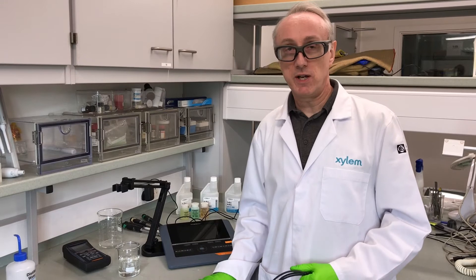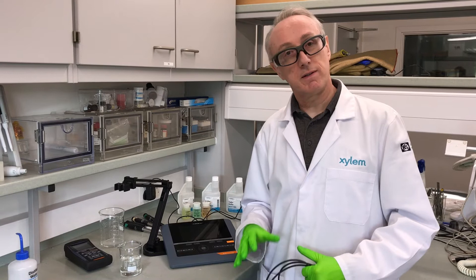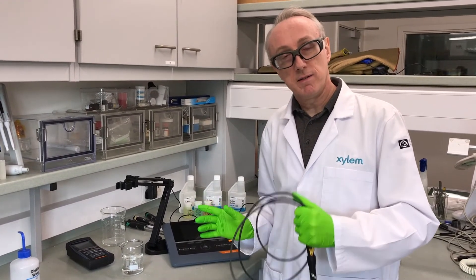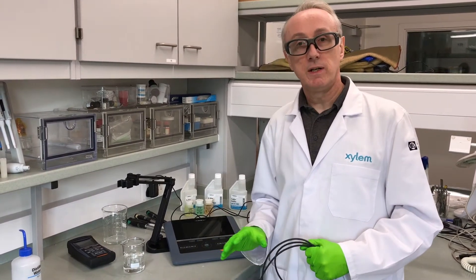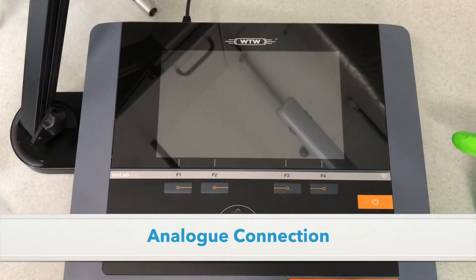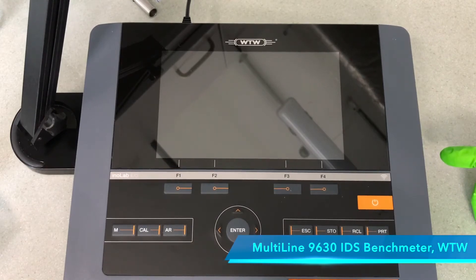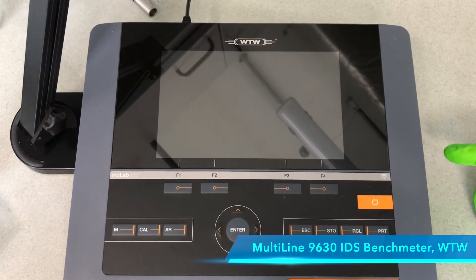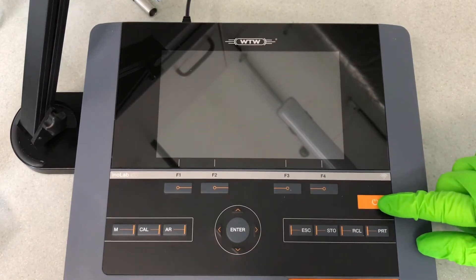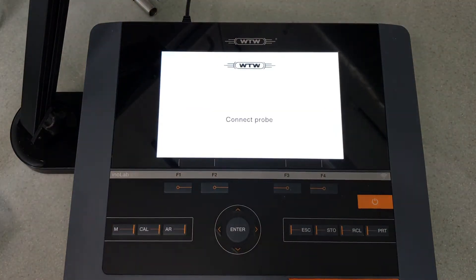In addition to digital technology, we now have wireless digital technology and that adds more benefits. So what we're going to do here is set the meter up from scratch, as you would do if you received it brand new. Here we have the bench meter — this is a Multi 9630 IDS meter. It has three connections at the back and they're all the same, which removes the problems that people have with different connectors and different types of probes. So if we switch the on button on, it's now telling me to connect the probe.